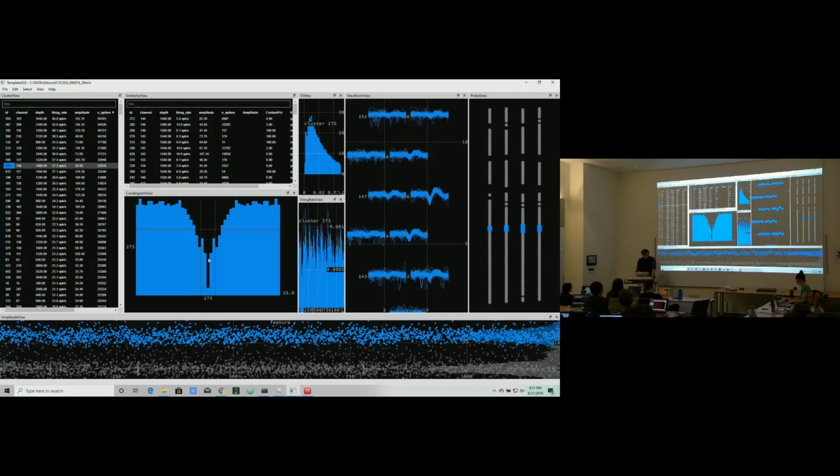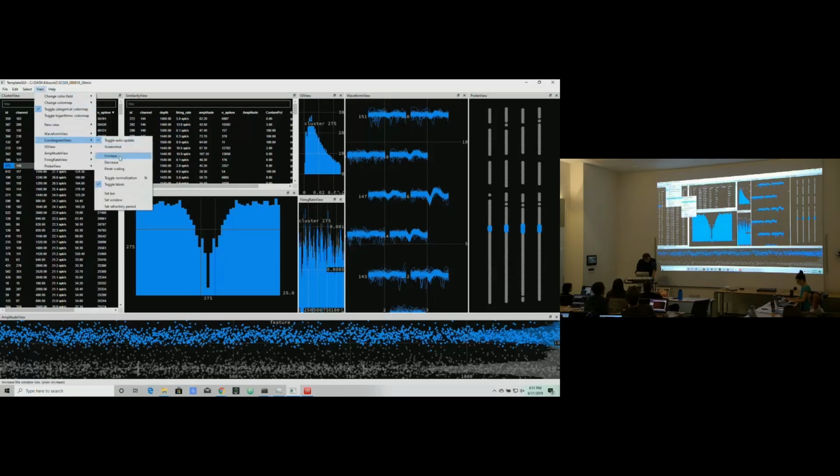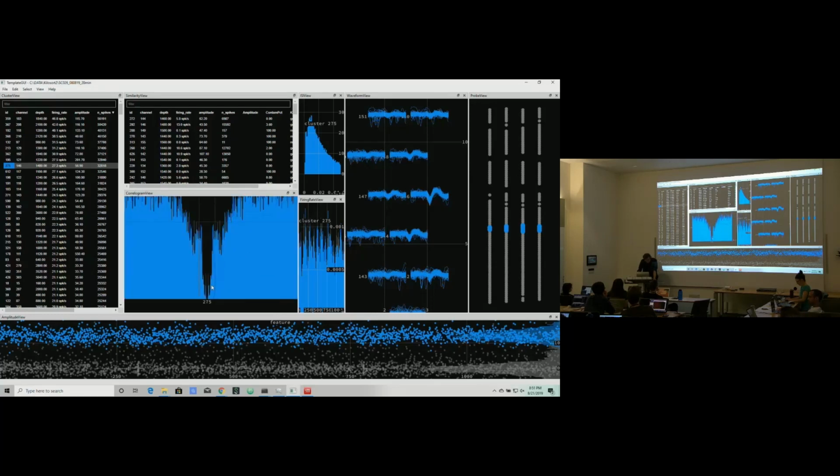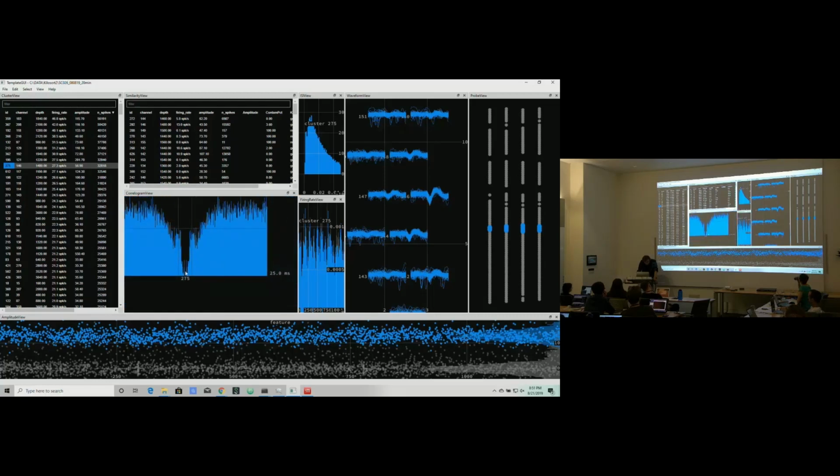And so this next bin, or increase the timing here. Right now it looks like we have 1 millisecond bins. So let's change that. I'm going to go to the Correlogram view, and I'm going to set my bins from 1 millisecond to 0.1 milliseconds. Okay? And now, again, you can see this kind of complete zero in the middle. So maybe more like, now these lines are still at 25 milliseconds.